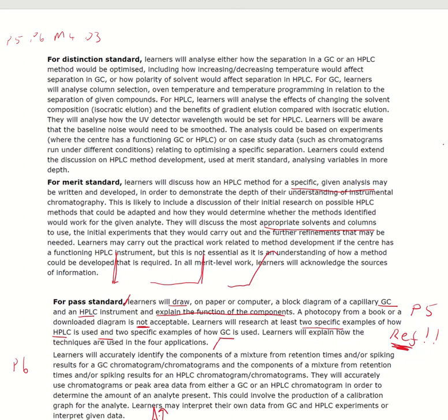Was the peak big and huge and smeared out? Was it very little? And you need to talk about what refinements you can make to your practical to try and get these so that you have the nice, crisp, sharp peak that we're generally looking for in all of this analysis. Key thing with this, you will be doing a lot of research for it, references, sources of information here. So that's going to take a fair bit of time on Google, to be honest.